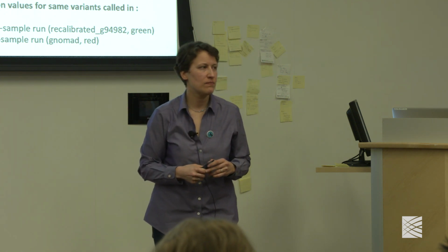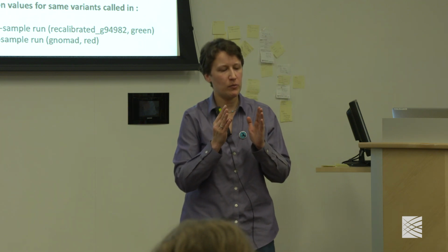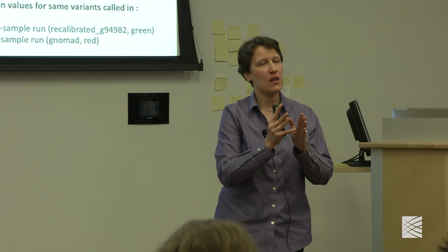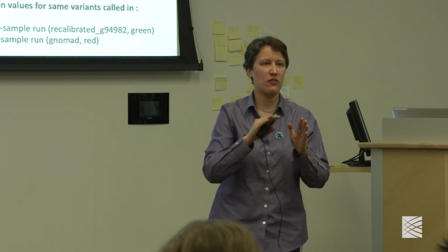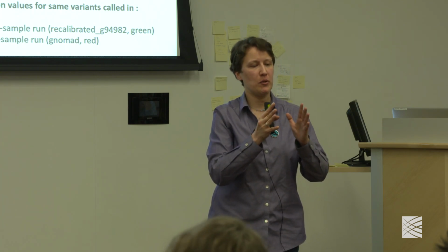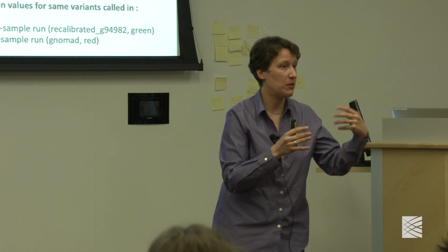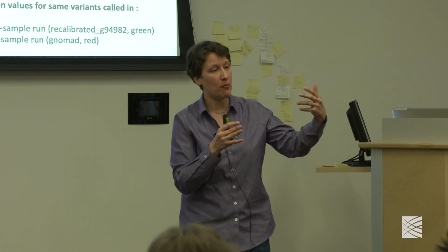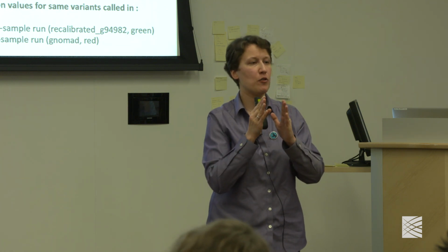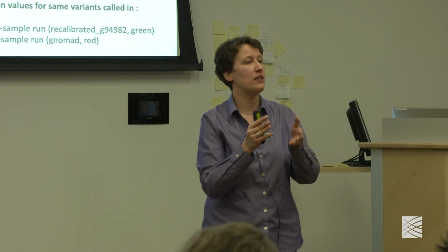So to summarize, we expect the distribution to be centered on 0, and we have expectations about what positive versus negative means. In practice, we may see things shifted because of the calculation of the statistic, or the original data has some kind of bias that makes it not conform perfectly with the way the statistic is calculated theoretically.